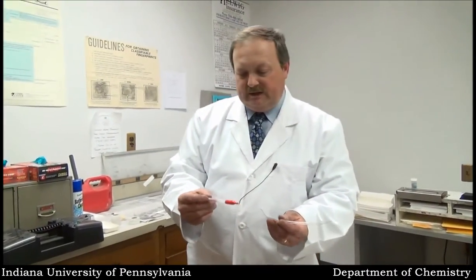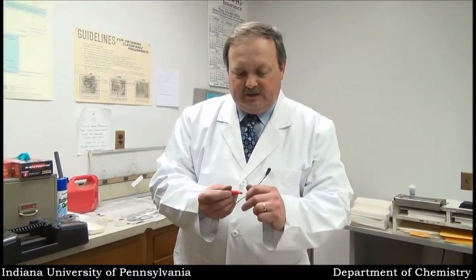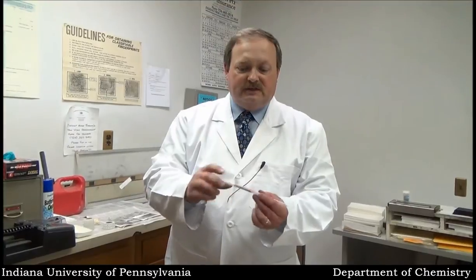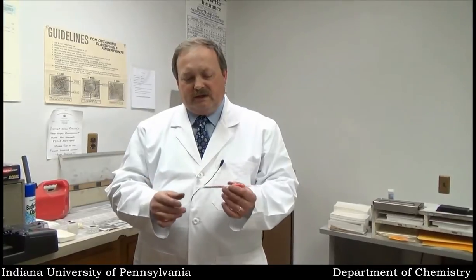The products we use in our iodine fuming kit — there are two ampules contained inside this tube. Iodine fuming works very well when you're talking about documents: harassing letters, fraudulent checks, threatening letters, those types of things where somebody might have handled them. If I put fingerprint powder on paper, it's going to be very difficult to lift or identify, and it tends to not work so well.